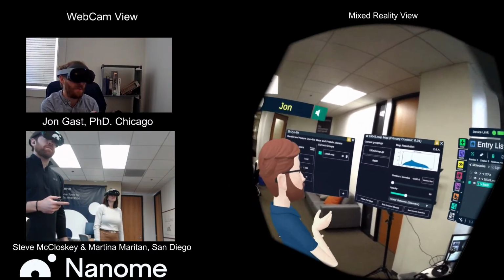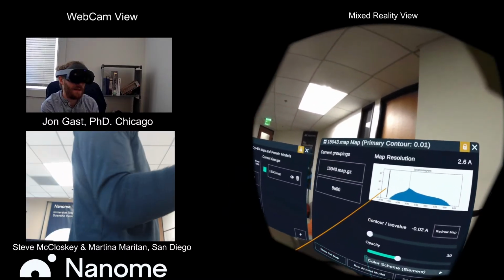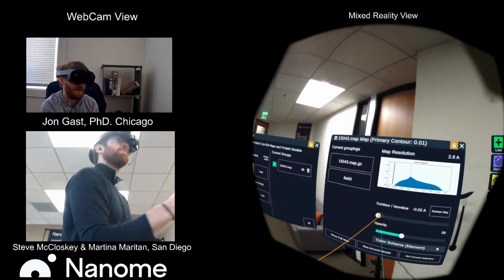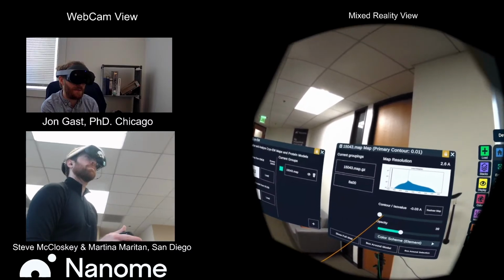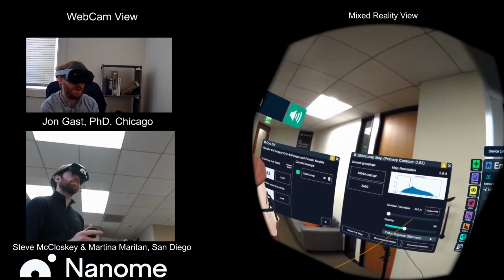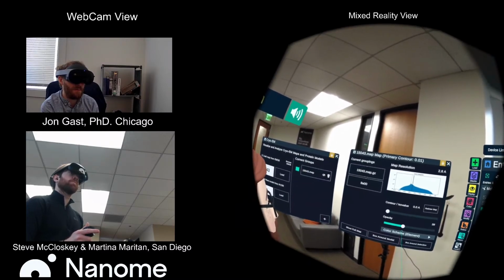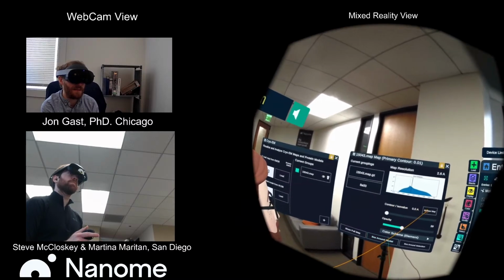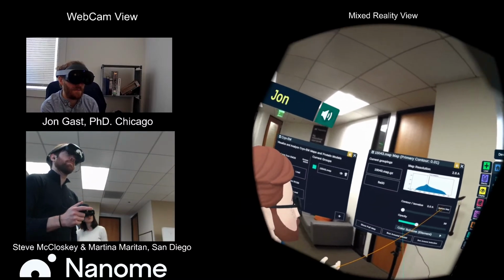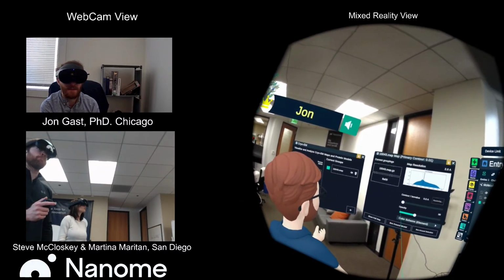What we have up here is this black line showing where the threshold is, and if we pull the slider along, we can bring it along there. The initial load-in was at one of these inflection points. So if I wanted to redraw it to here, I'll just click on redraw map, and it'll take a little bit to do the calculation.